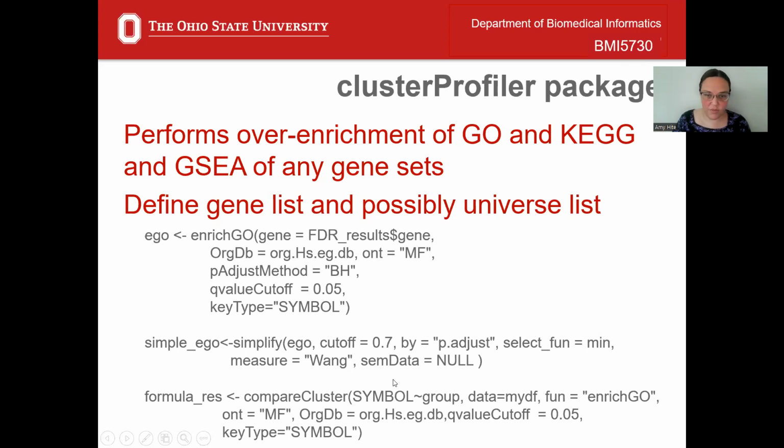Okay. And we do that with the formula set up where we have, in one table, all of our gene symbols and we have our groups. So we're relating this group comparison to the gene symbols in this compareCluster function.